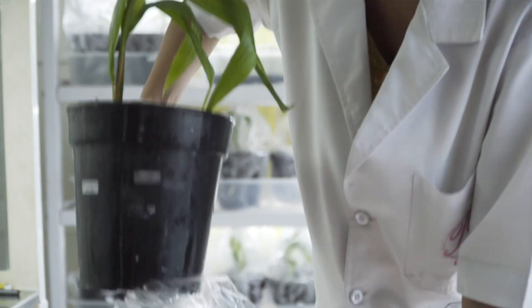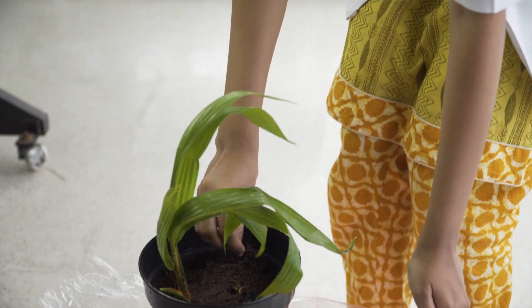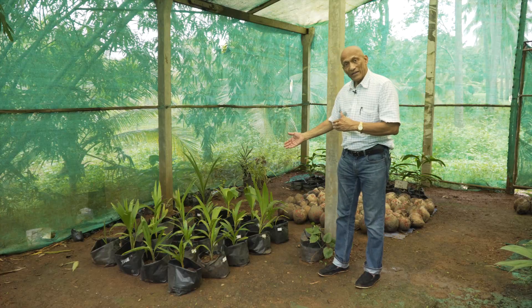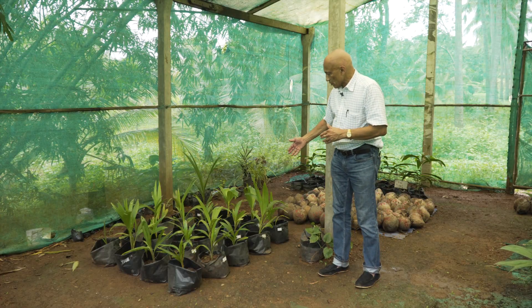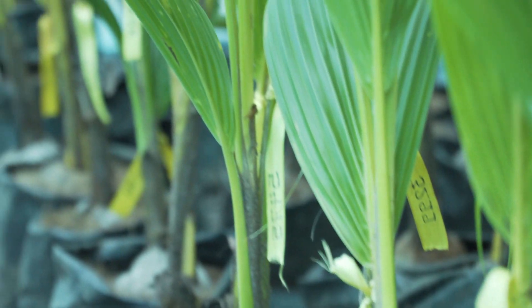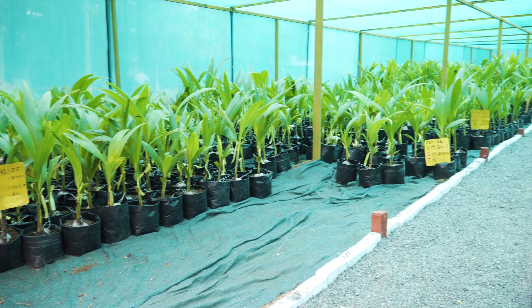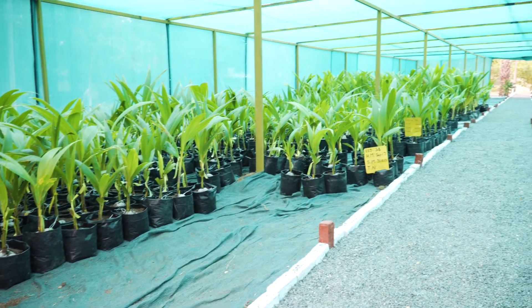It's then grown for at least six months in the laboratory and then brought out for hardening. Here is a small batch which has just come to the greenhouse for hardening, and in a few months — three months time — they will be ready to be planted in the field.